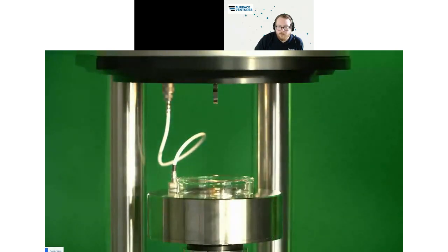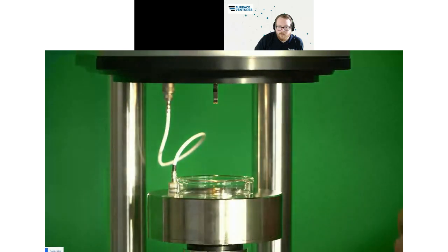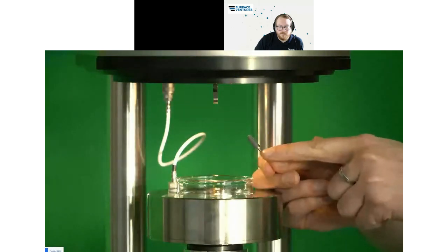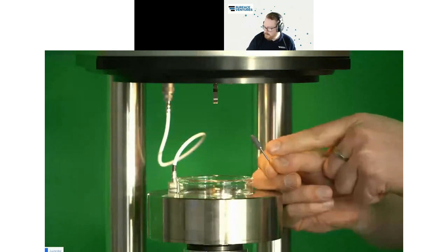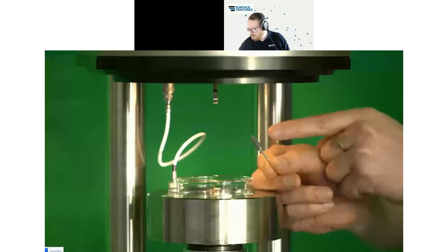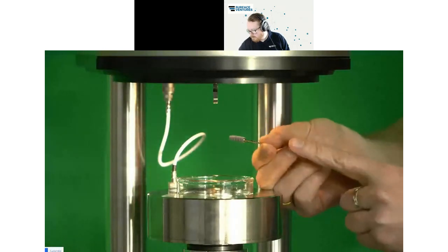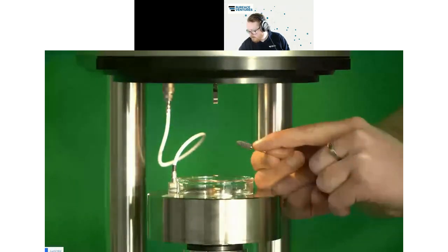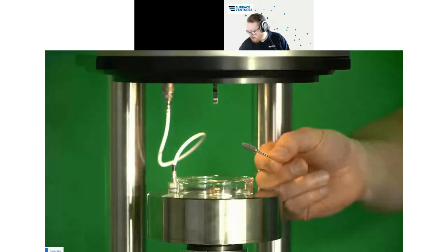Now I can remove the sample here, this has done its job for today. And now we are taking the tooth implant. And for fixing the tooth implant, we have developed here a special probe holder. So this is a tooth implant. This is what is screwed into the bone of your mouth. This is what needs to be accepted very well by your body. This kind of implants always also have a hole on the top where you can fix a screw inside. So this is where your tooth later on will be screwed into it.